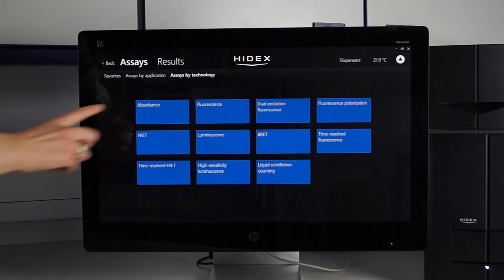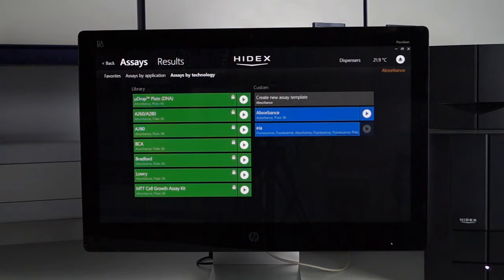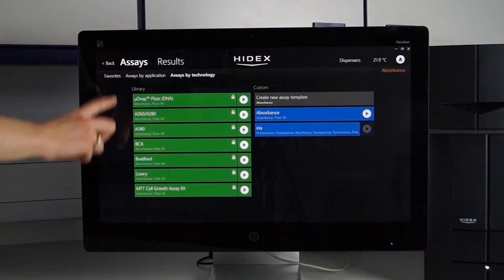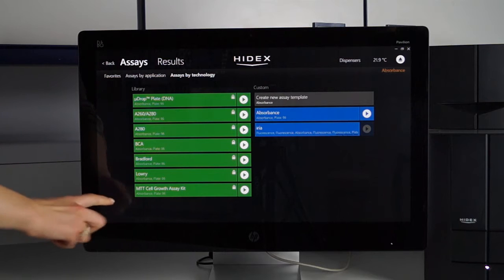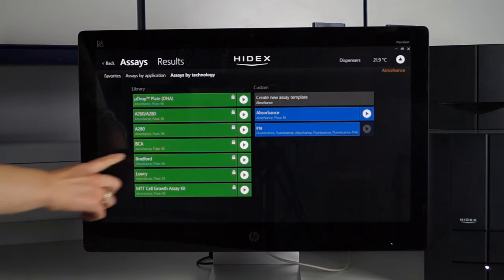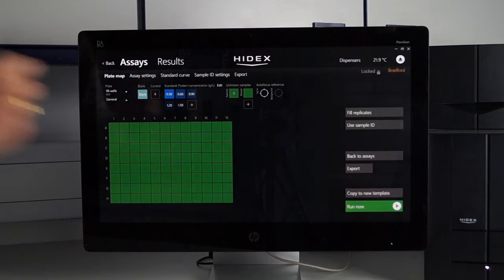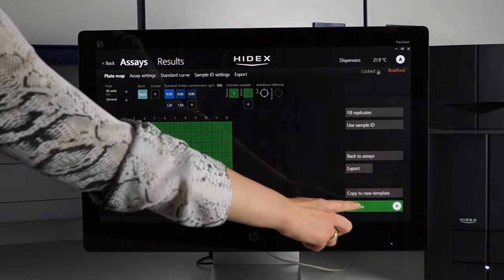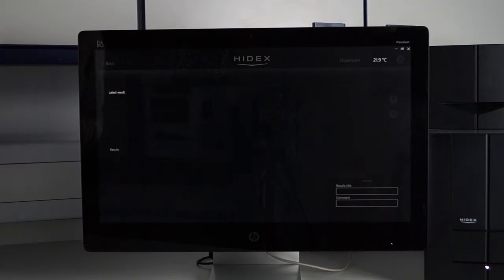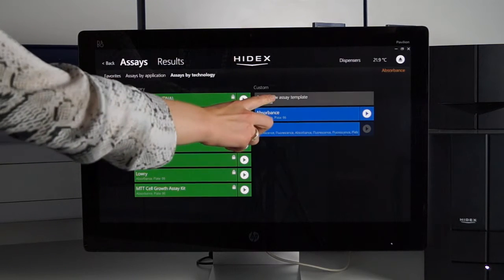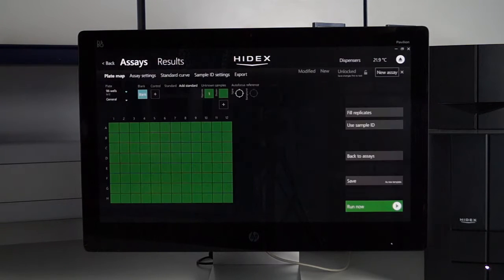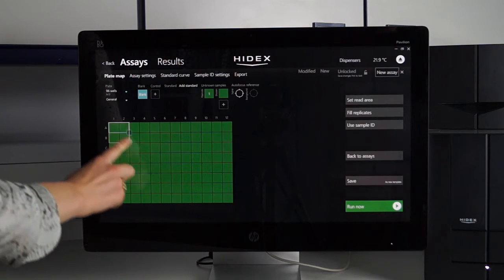The HydexSense comes with a comprehensive assay library featuring common absorbance templates ready for you to simply press play and run. You can also easily create your own custom assay templates if needed.